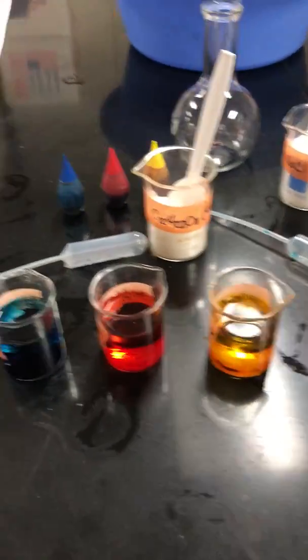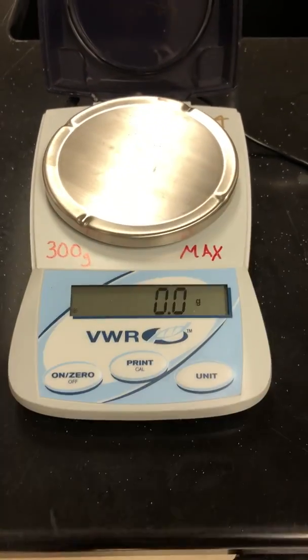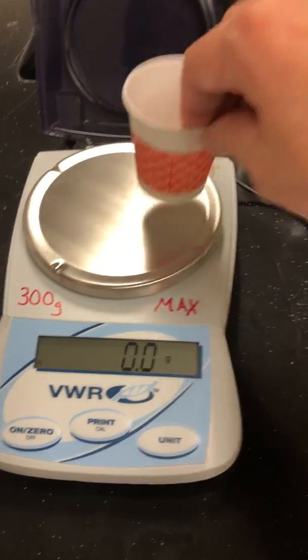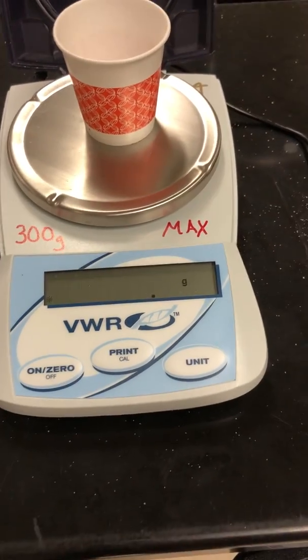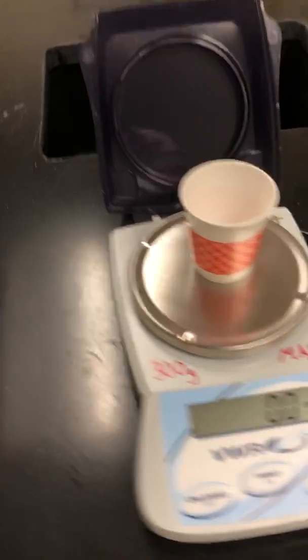Okay, so then it tells us to measure our substances. So we go over here. You want to make sure your balance says 0.0 first. Please do not ever press on the balance. It could break them. We want to get our cup on there because with technology, even though it says 2.1, I can zero it out. Boom, and now you don't have to subtract the mass of the cup.